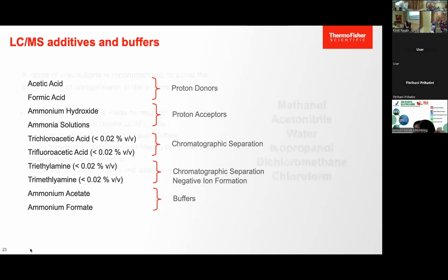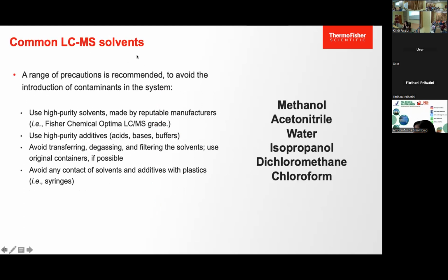Okay, so these are the solvents that we will mainly use, and it depends on your focus. If you are doing a high concentration natural product, ppm level, you may not need LCMS grade. But if you are doing a routine sample and want to detect PPT level, PPB level, then the organic solvent grade will help. Because with a better grade of solvent, you will get lower baseline, less interference, and your chromatography will be cleaner.